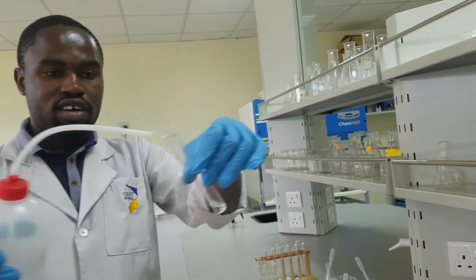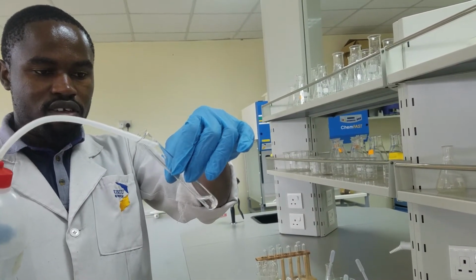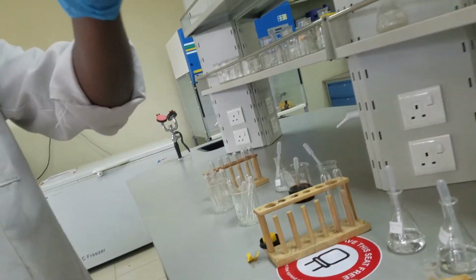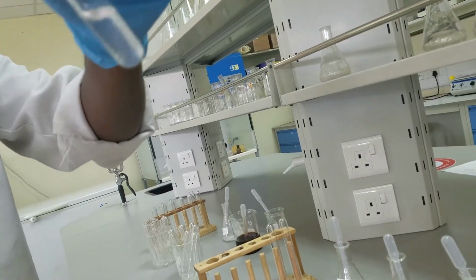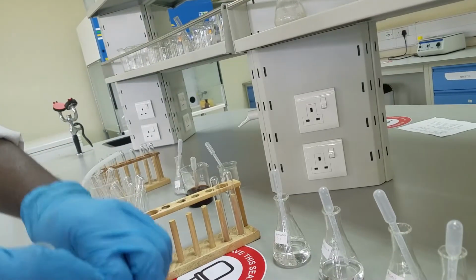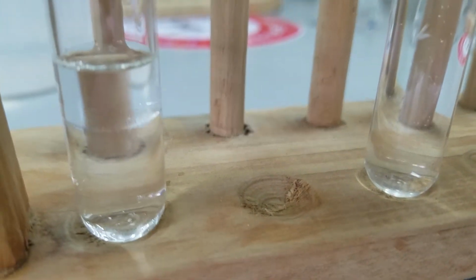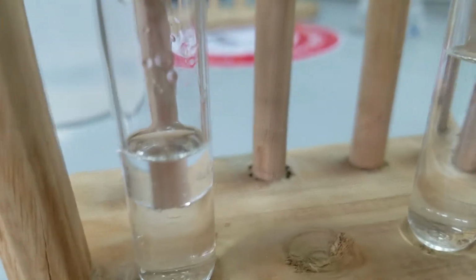Just add a few drops, and then we add water. Now we should view. See if there is any difference from the other.